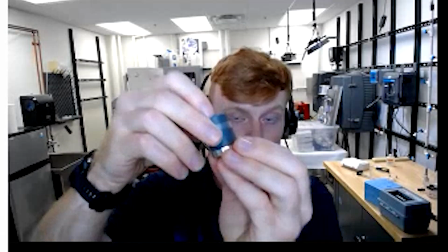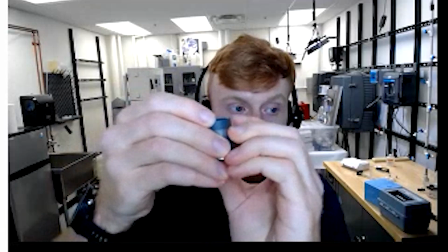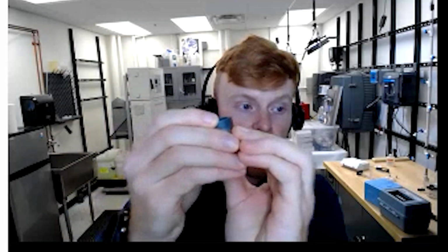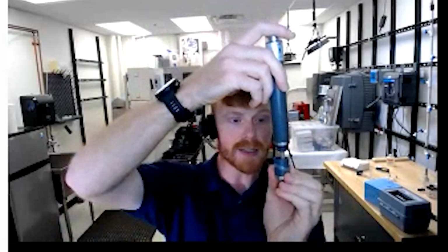Whenever I'm installing my new electrolytes, I want to turn our attention to our membrane cap. This is something that I see missed all the time, and I really want to highlight it: when you are replacing that electrolyte, I want us to see this little rubber piece. Pull that down to expose a little hole that's on the side there. And we want that hole to be exposed so that whenever we add in our electrolyte, we add it with as minimal air bubbles as possible.